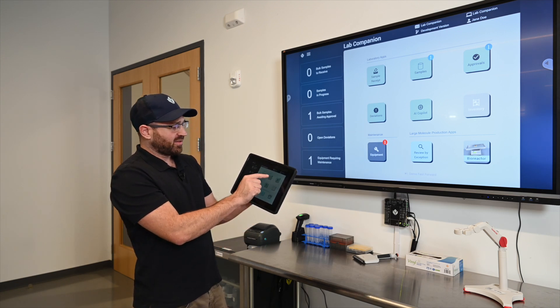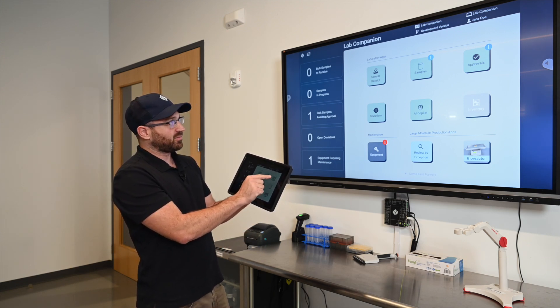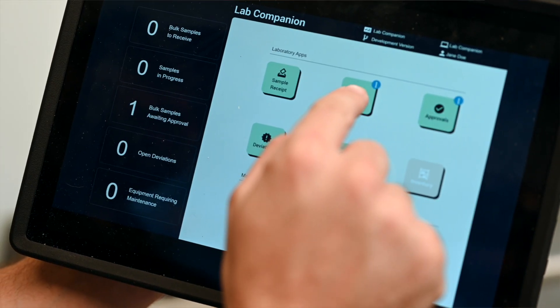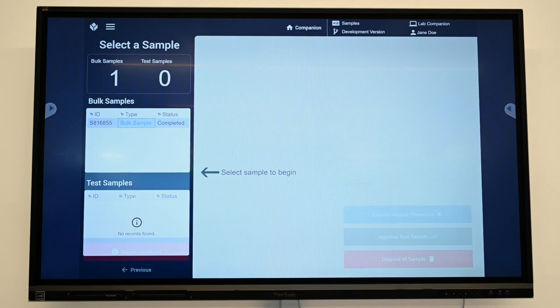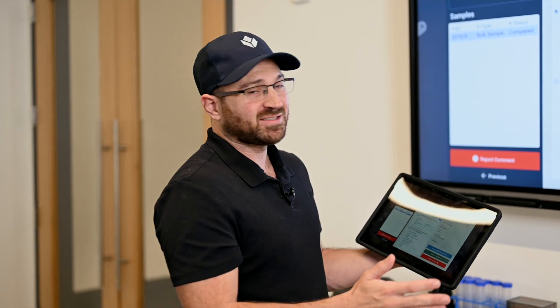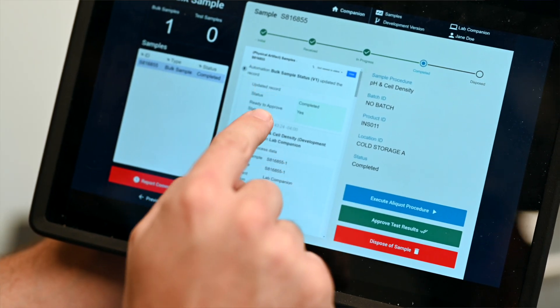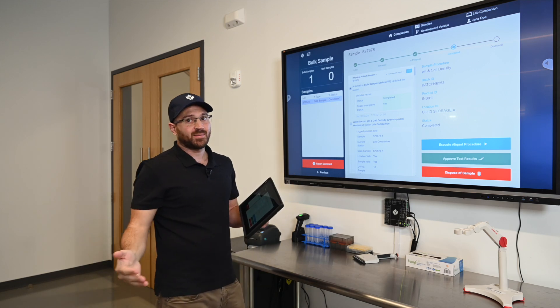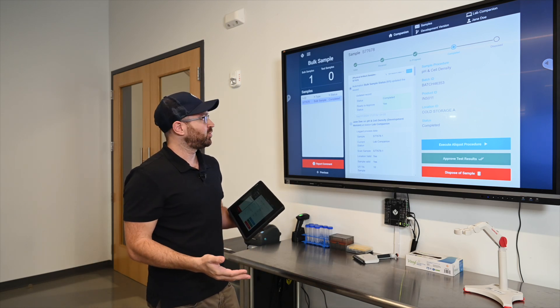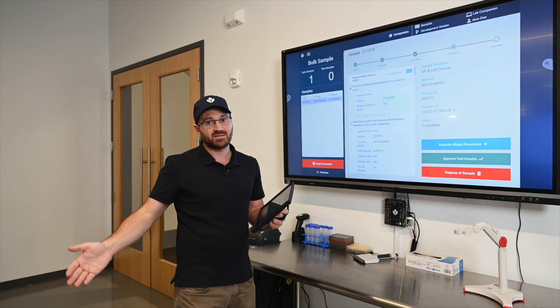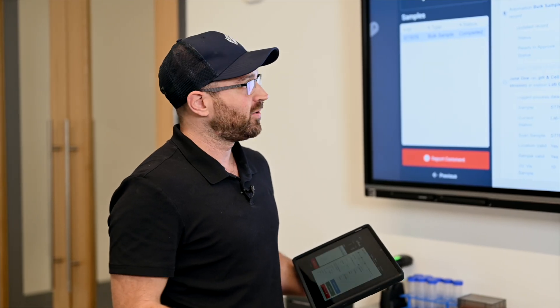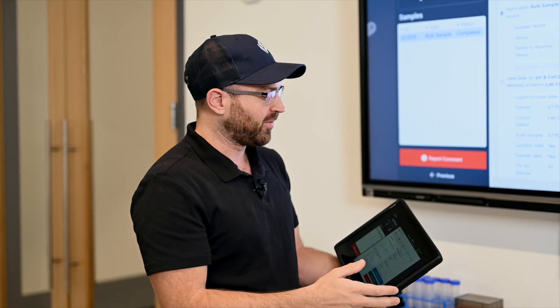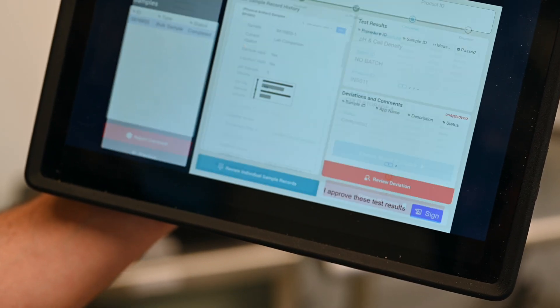As you can tell the approvals button is now showing up as one notification. So as a lab manager or someone who would approve samples I can click on this bulk sample and it is now time for me to approve this because all the tests have been completed. Now you can see here that there's an automation that occurred. When we complete test samples in the background, automations are running within TULIP which are checking to see are all test samples complete, and if all test samples are complete we're going to complete the bulk sample and make it ready for approval.